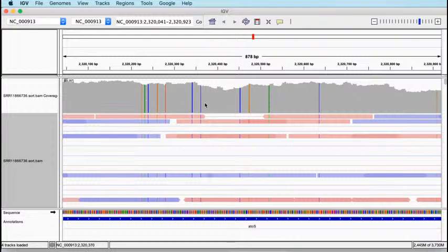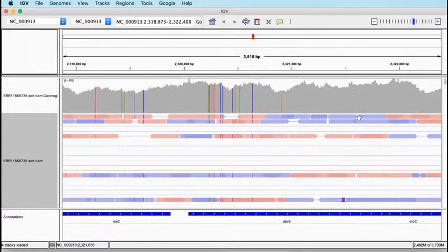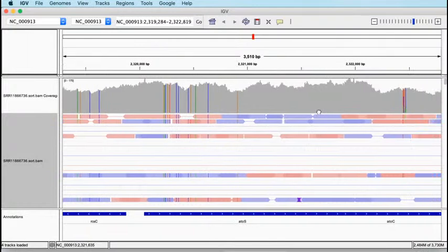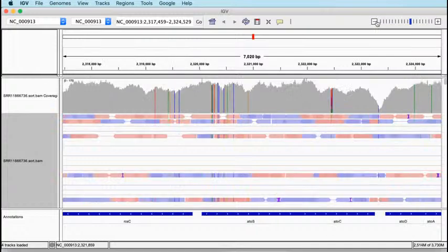If you were viewing an RNA-Seq experiment in IGV, which, if you've produced an alignment, which we didn't when we did our RNA-Seq analysis, but if we had, using an RNA-Seq aligner like STAR, for example, and you color it in this way by the first in pair strand, you can get an idea about the stranding of your experiment.